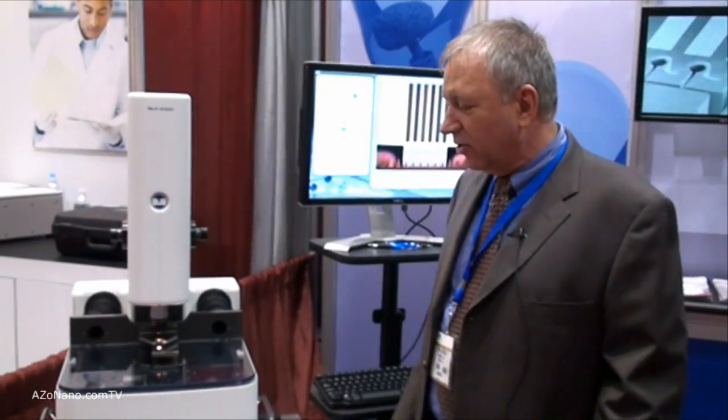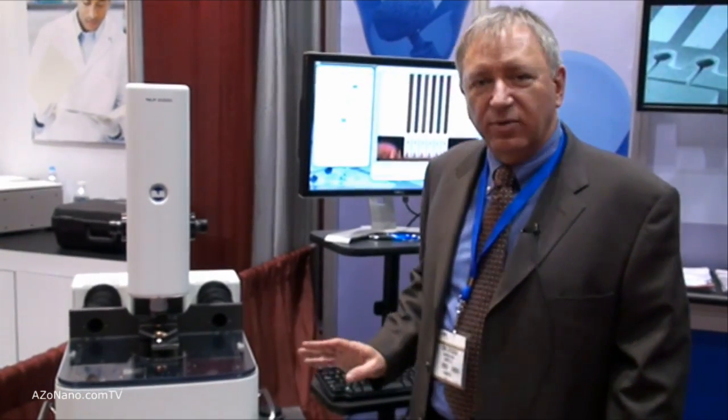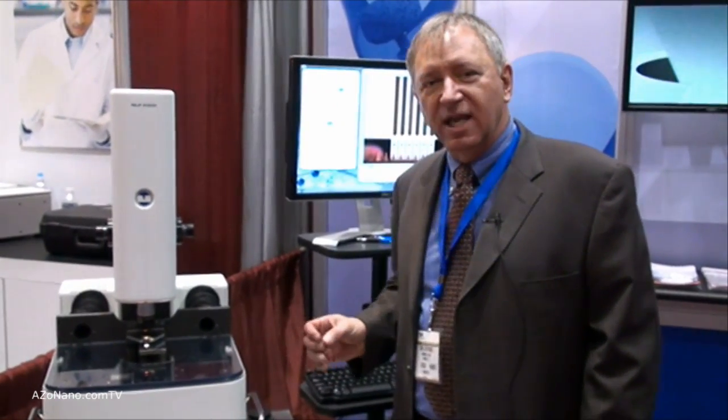It's very simple to operate. There is no integrated atomic force microscope in this, so even though it uses the same technology, it does it with a different series of stages to move.